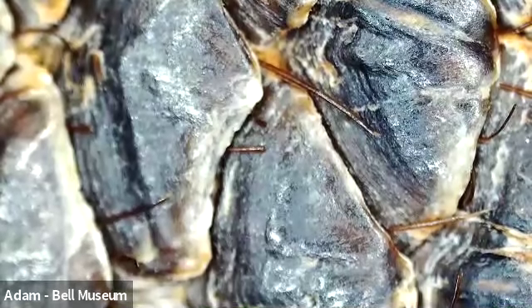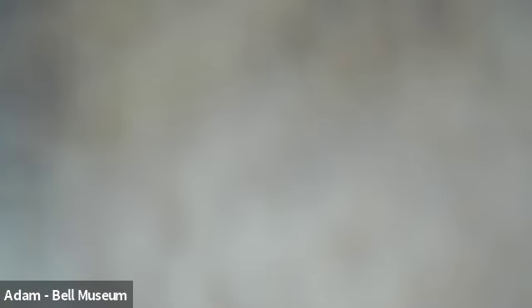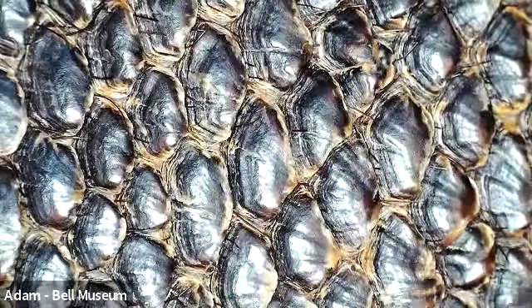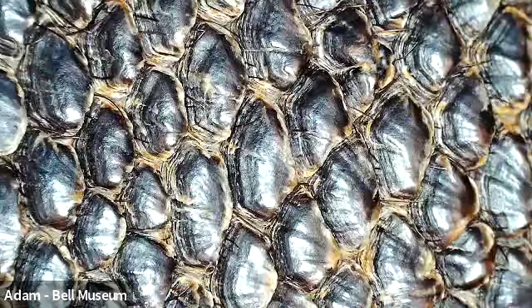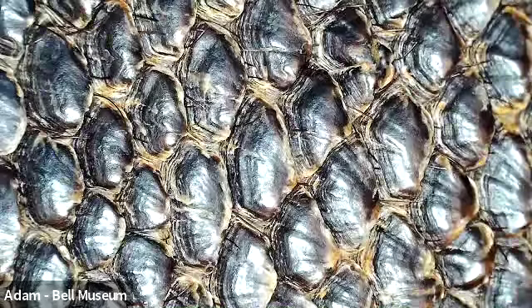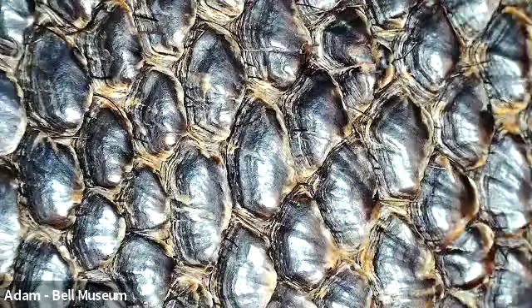Okay, I'm gonna go ahead and zoom out to the second stage here. So just give me a second while I refocus. Okay. Hopefully you guys can see that all right. Your second clue is this organism is an excellent swimmer found in ponds and lakes around Minnesota. And just some more crickets for your thinking.